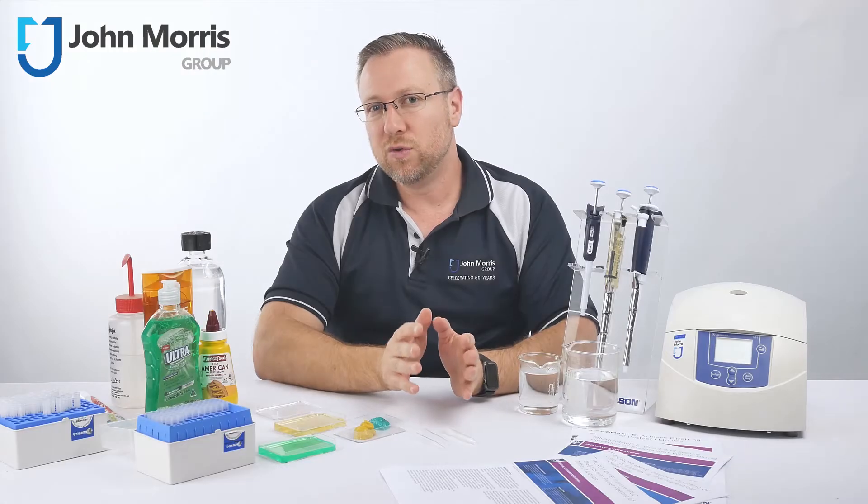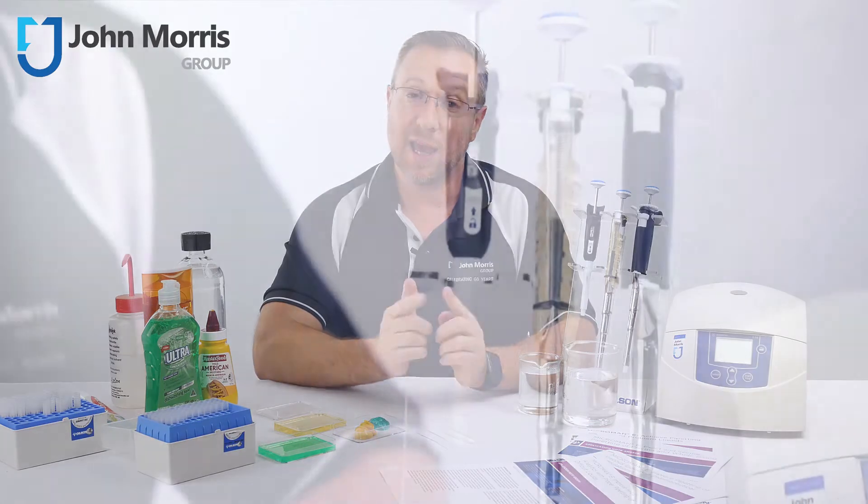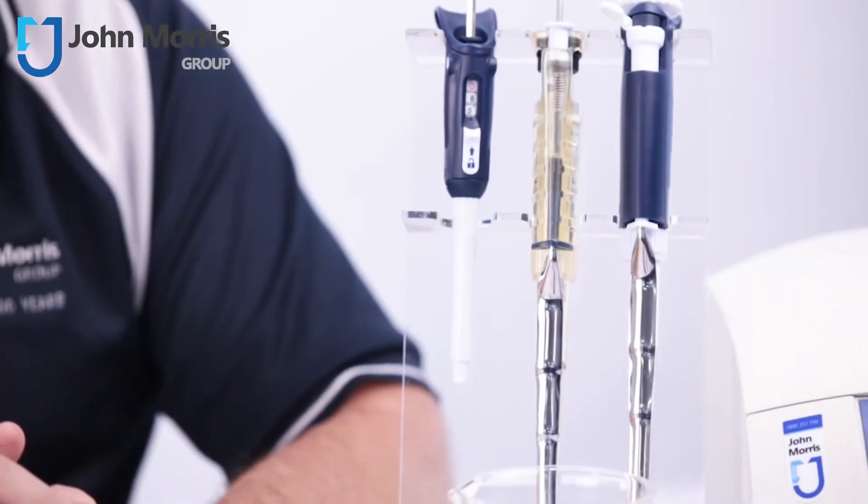Broadly speaking, there are two styles of microvolume pipettes: air displacement and positive displacement.